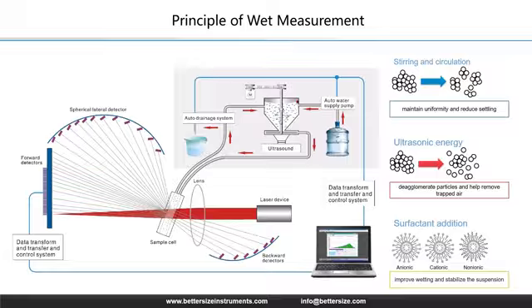But flow alone is insufficient. On the right, we see how we actively manipulate physics to ensure a true dispersion. First, gravity. Large, dense particles naturally settle. We counter this with stirring and circulation, creating a mechanical suspension that maintains total homogeneity.